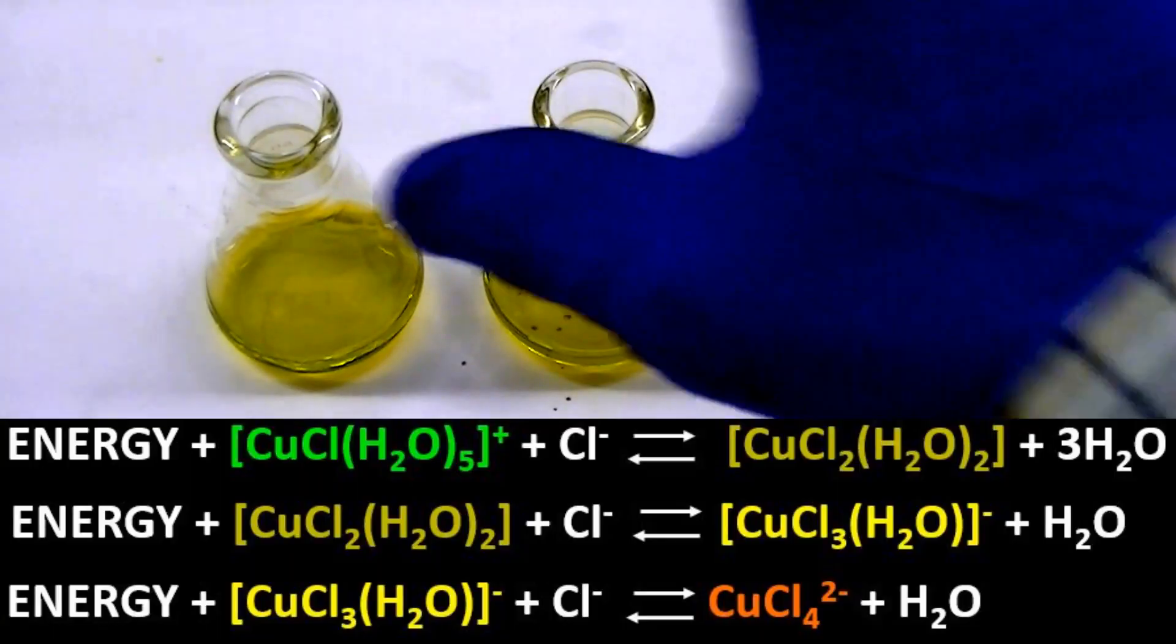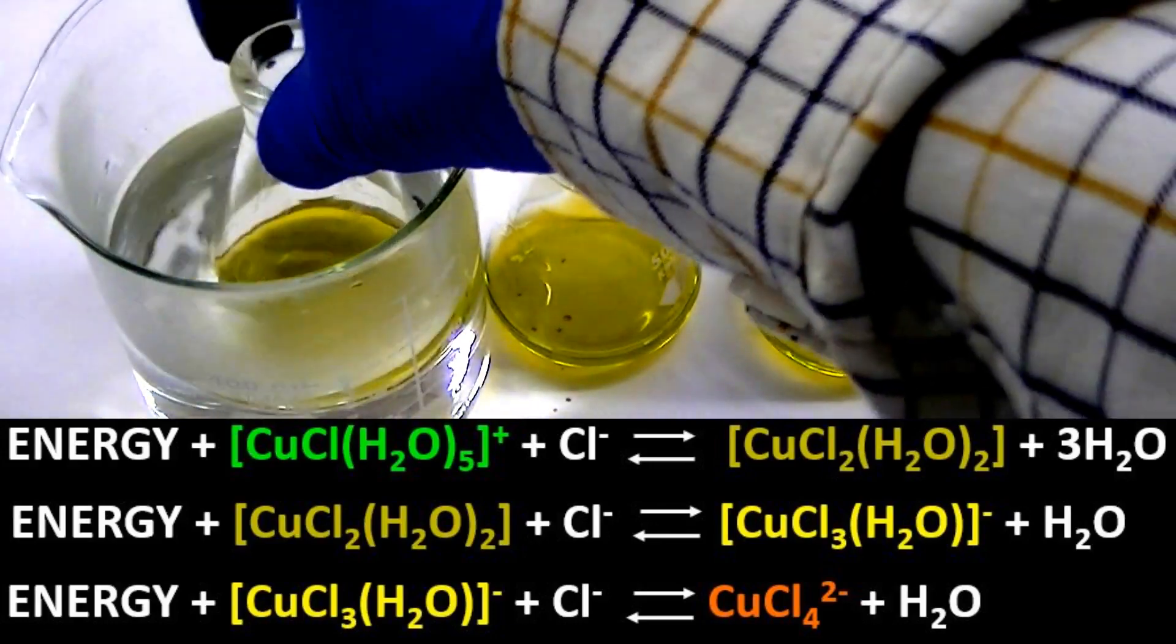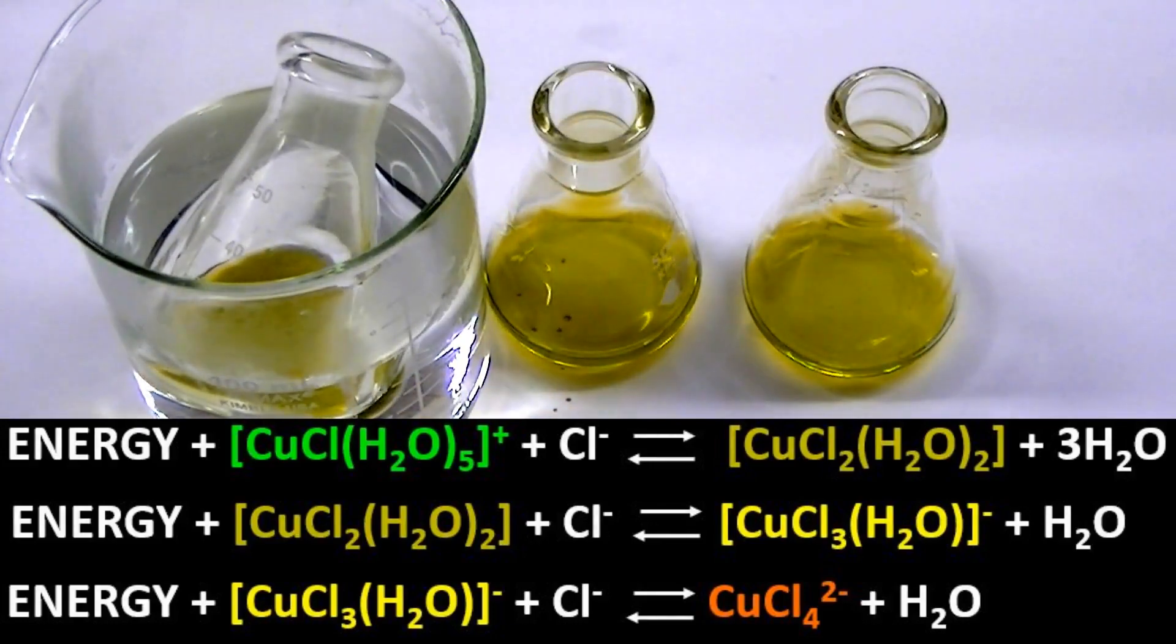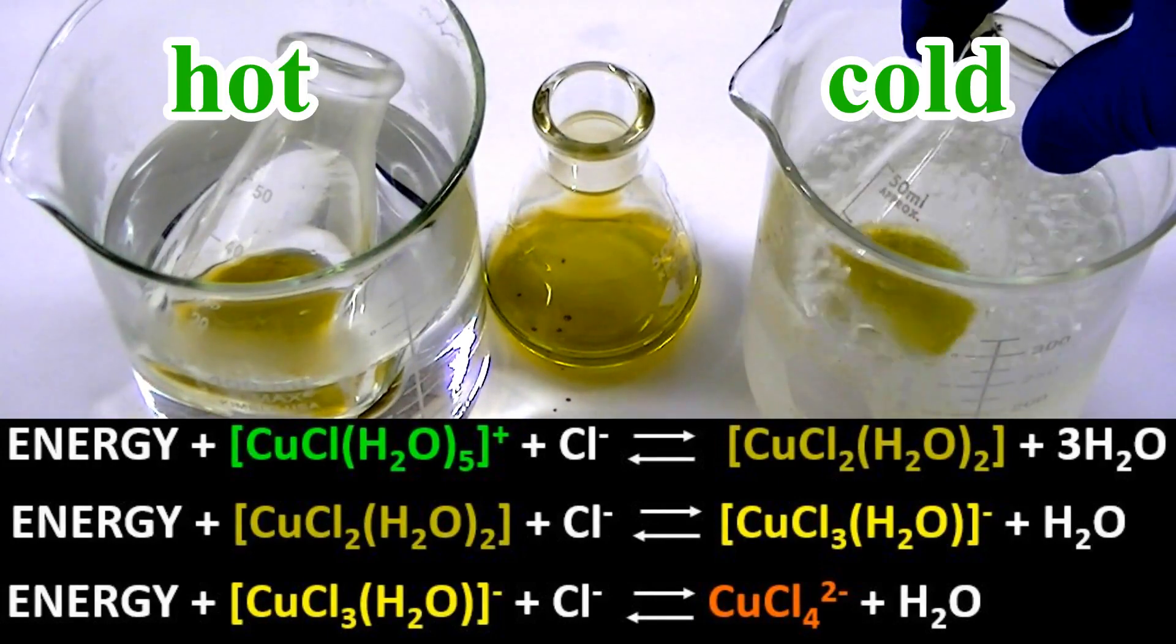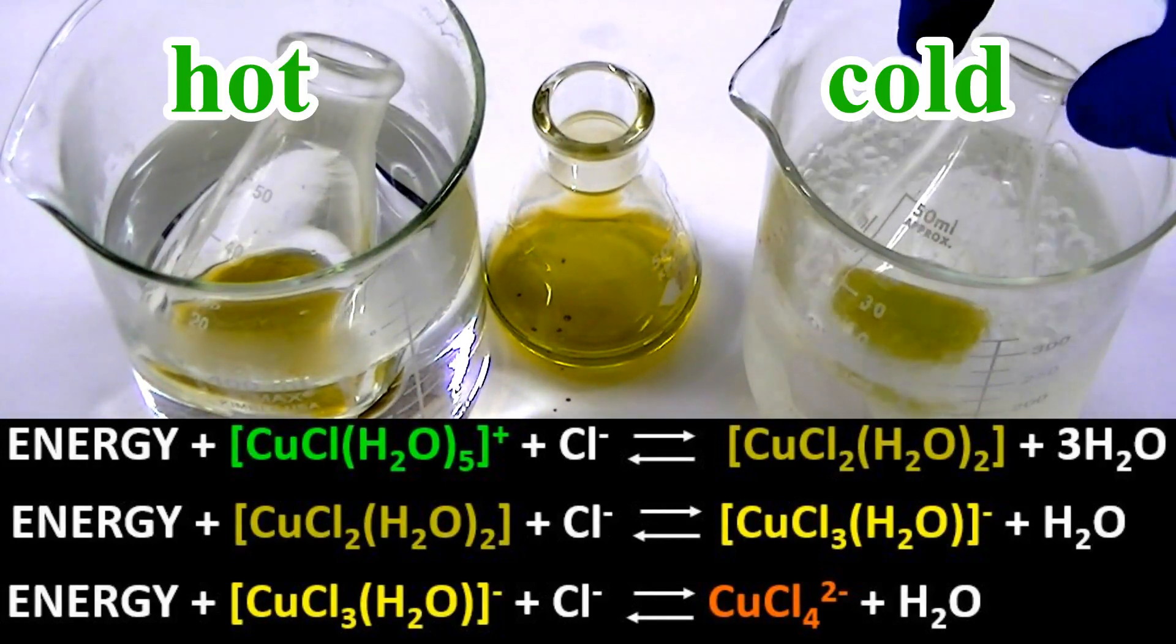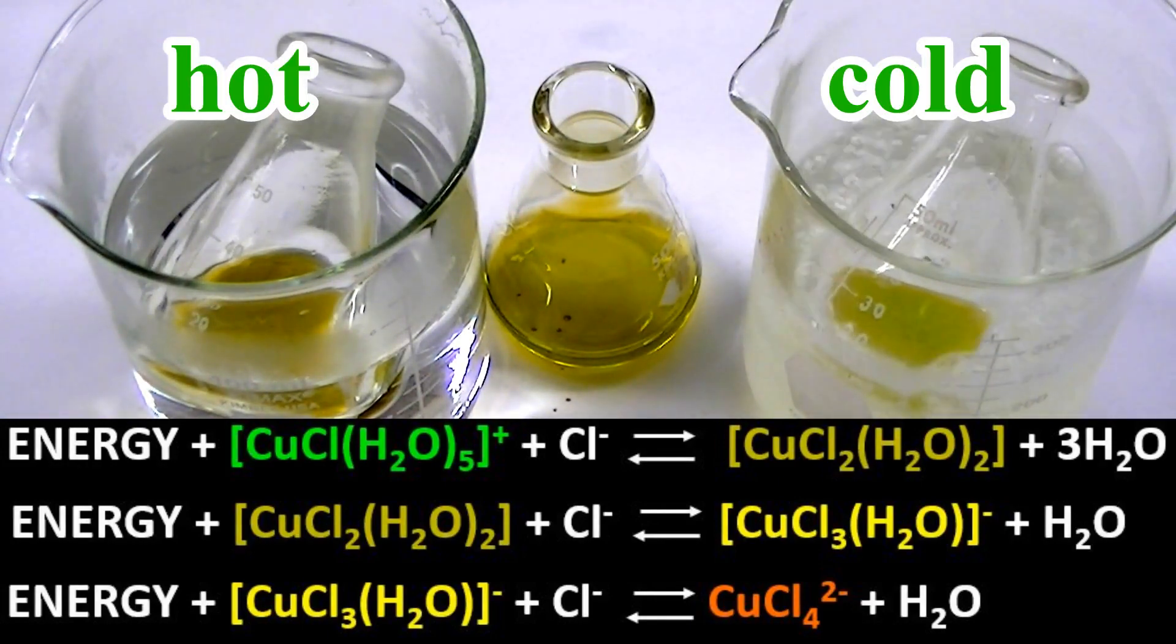I'll place portions of this solution in some hot water on the left, and some acetone that's been chilled with dry ice on the right. The yellow-green dichloro-copper complex participates in several reactions with water and chloride ion. Some of these reactions are illustrated below.